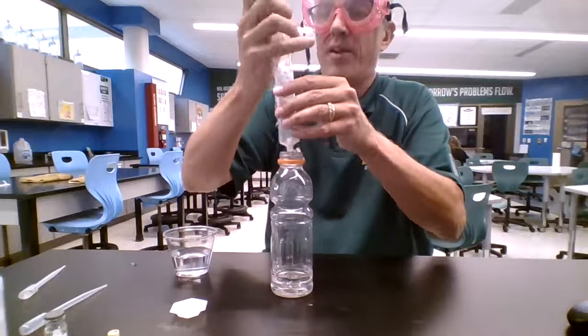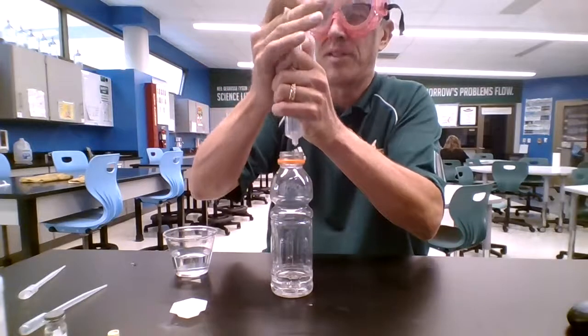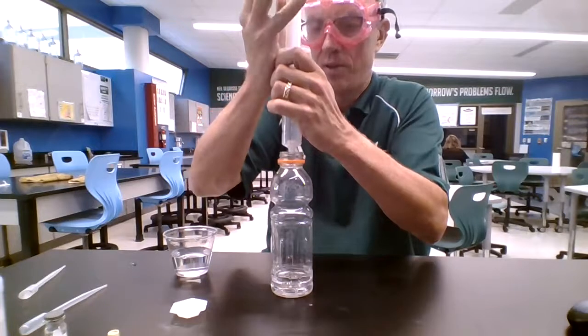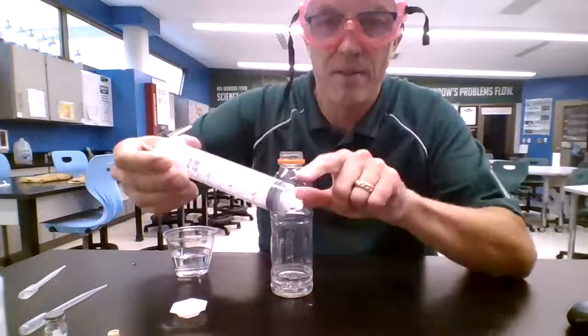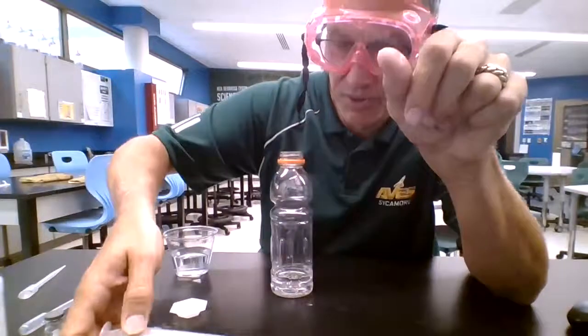Now, next thing we're going to do is to do this. And by the way, if I didn't say this before, I apologize, but Dr. Bruce Matson from Creighton University and his students perfected this. It was not me. Okay. So we're going to squeeze that down, keep it steady and upright. Hey, lo and behold, we now have our reagent in there, that little cap. We're just going to put this down, and life is good.